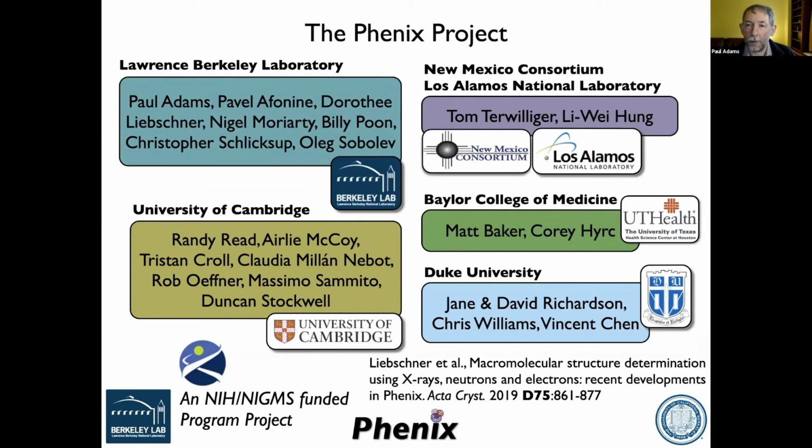No, that's not. To understand a little bit, I think, the history of those scattering factors: the electron scattering factors are, as I understand it anyway, based on a mathematical conversion of X-ray scattering factors. And in the X-ray case, there is no dependence on the wavelength or the velocity, what we're going to call it.